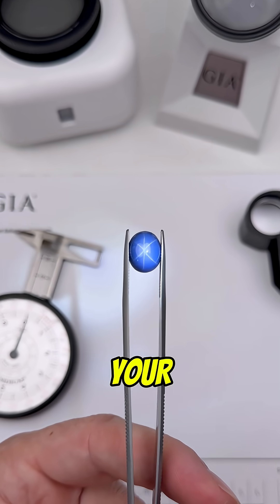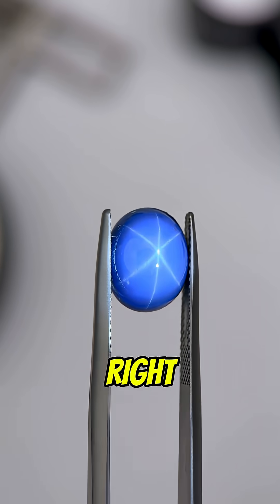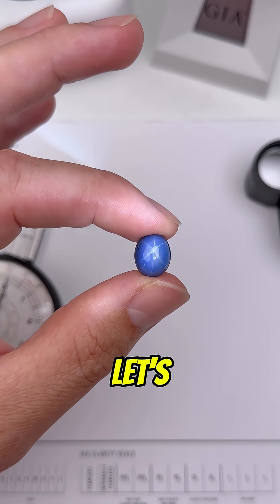Is this a real or a fake gemstone? Drop your best guess in the comments and I'm going to show you how a gemologist figures out what this is. Right off the bat we can see this gem is special because it has a six ray star, so let's start testing.